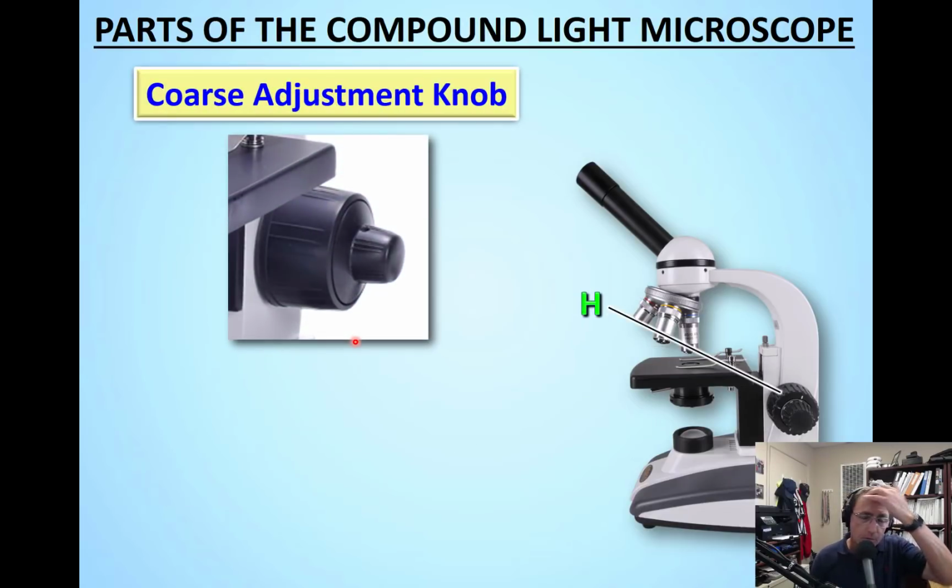All right, so we're going to talk about these coarse and fine adjustment knobs. Again, your student microscopes don't have them, but some do, and like the teacher one does. As you move forward in science, hopefully in high school and beyond, you'll likely run into microscopes that have these coarse and fine adjustment knobs. Okay, so the coarse knob is bigger, and it's also the outer one.